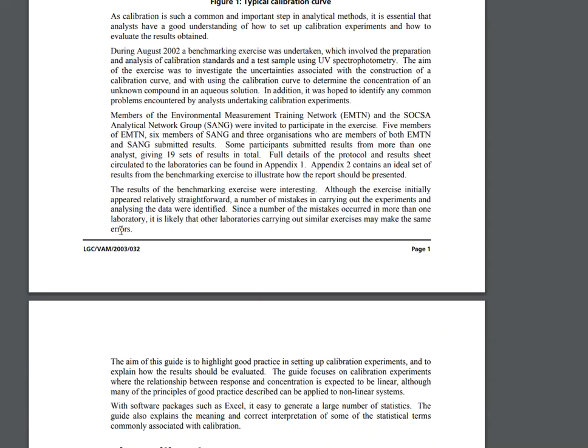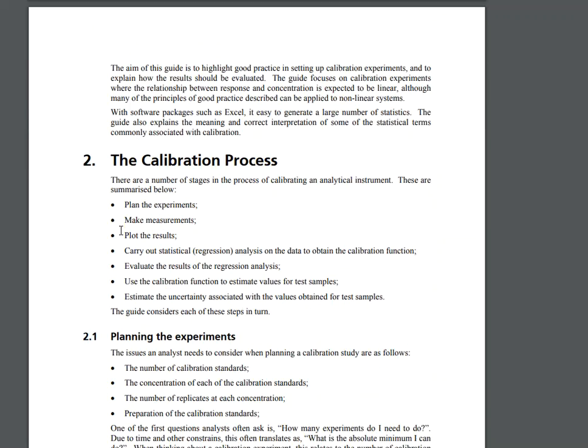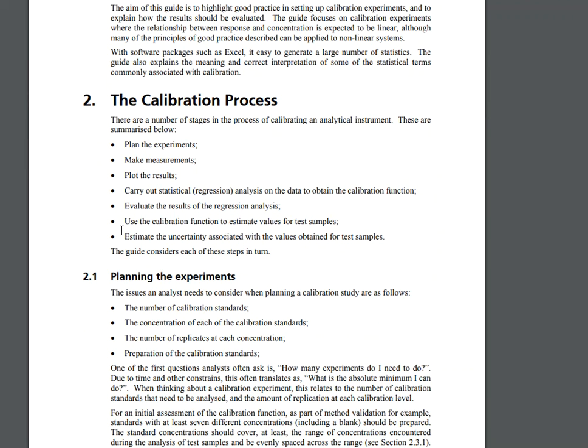If I keep scrolling on, it says that they begin to study these people in a lab environment, and they break them out into groups, and they allow the groups to prepare their own standards and run their own samples, and then generate a calibration curve. And then they looked at this data and stepped back and said, okay, what's wrong? What could have improved here?